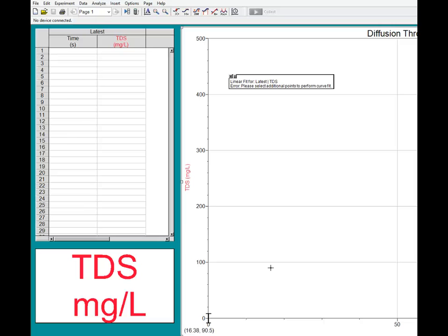Remember, you're only doing Part A today, and if you have a little time, you can read about Parts B, C, and D. And if you do get a little time, for Part C you also need dialysis tubing, so you could cut that ahead of time and get that soaking, and it would be okay to soak that overnight.